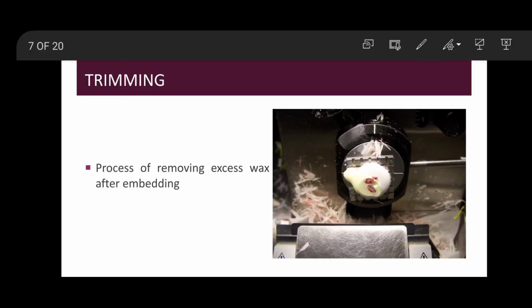Before you subject your paraffin-embedded tissues to section cutting or microtomy, you must make sure that you properly trim the edges of the paraffin-embedded tissues to remove the excess wax.